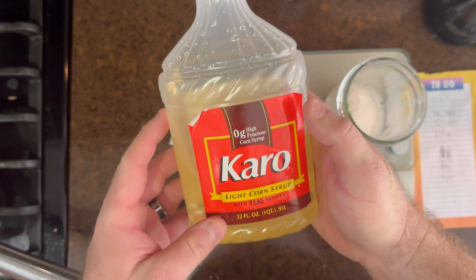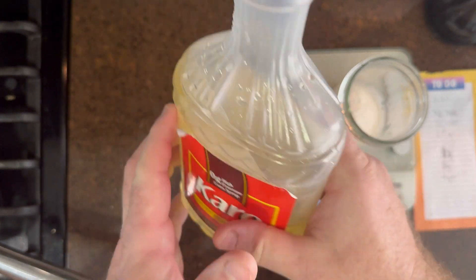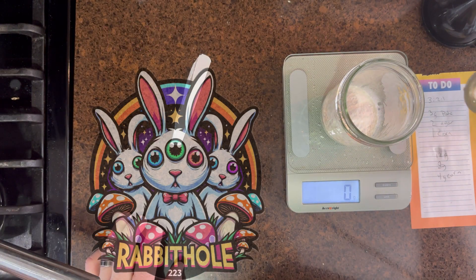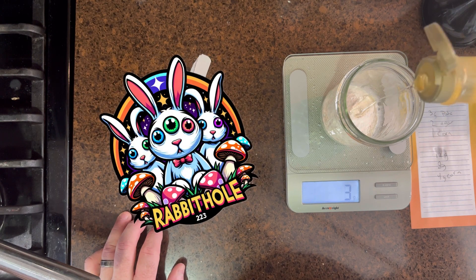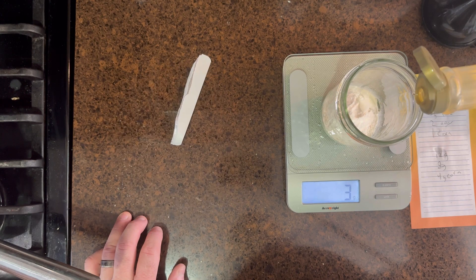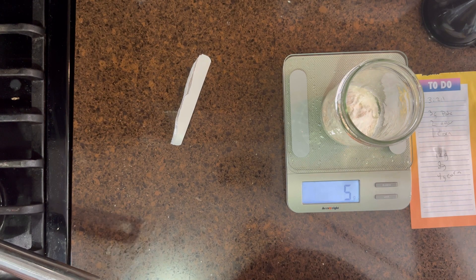I basically needed light corn syrup but unfortunately the one I have has vanilla in it, which isn't supposed to be exactly helpful, but it's what I had. It seems a little hard to justify buying a full bottle of light corn syrup when I'm only going to use four grams — a bottle of that would last me 30 years.